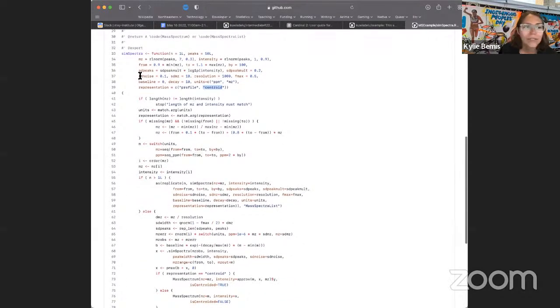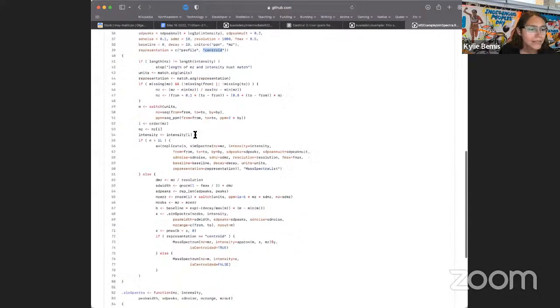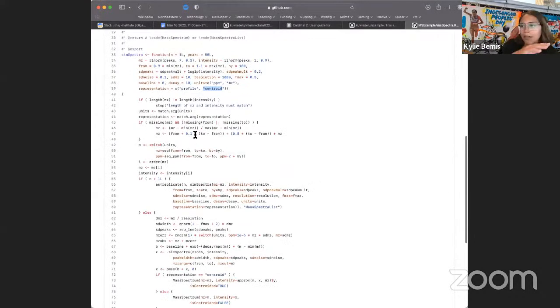You can specify different things like the standard deviation of the peaks, of the noise, all these different things, and it basically works just by creating Gaussian peaks, overlaying noise, simulating some mass shift, and other things like this. But yes, it's available both here. You can copy paste it if you credit me. It's also available in the Cardinal package on Bioconductor as simulate spectrum from there.